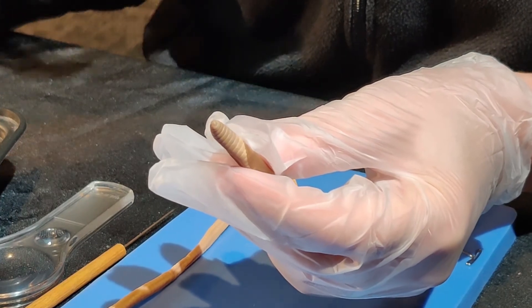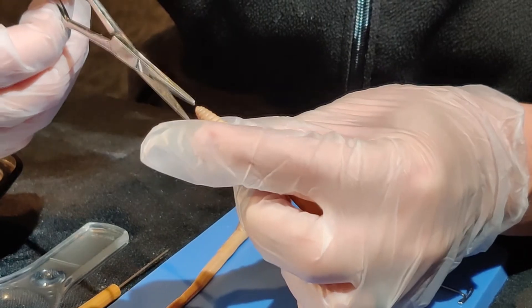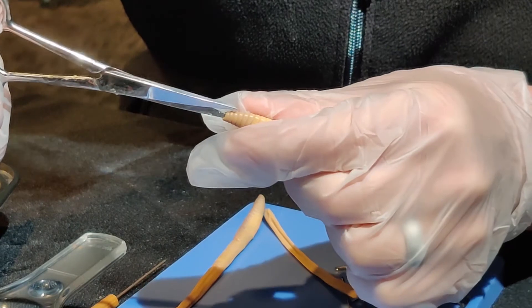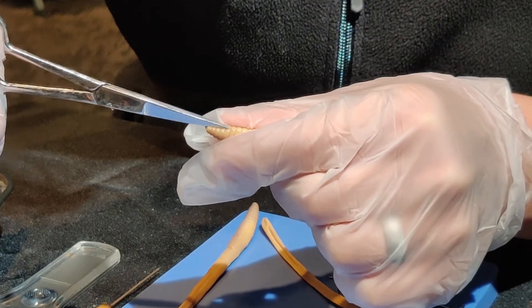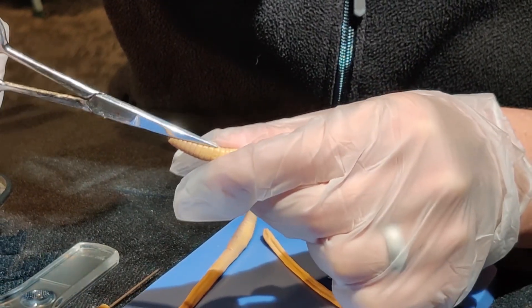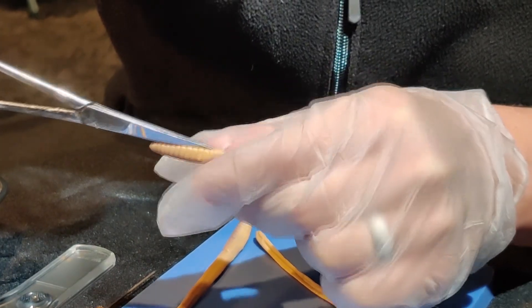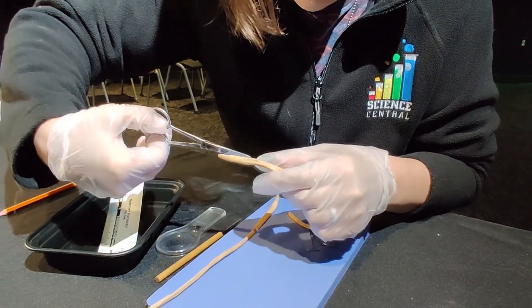For the dissection, you're going to want your students to take their scissors and insert them into the mouth of the earthworm, cutting just through that layer of skin. They're going to cut their earthworm down through the center to the saddle.